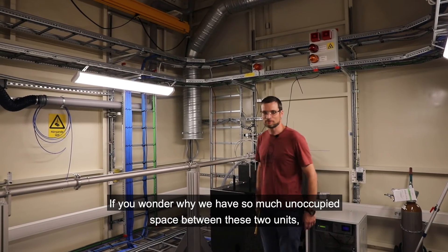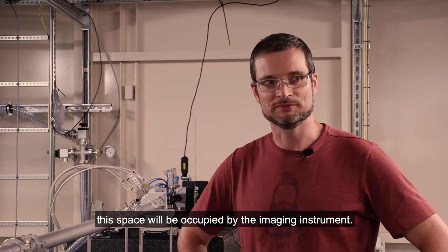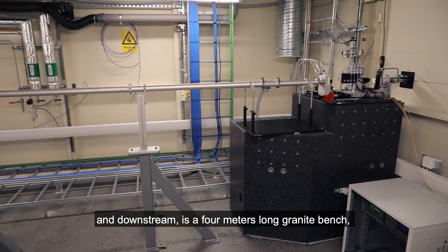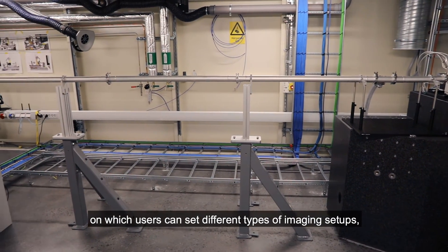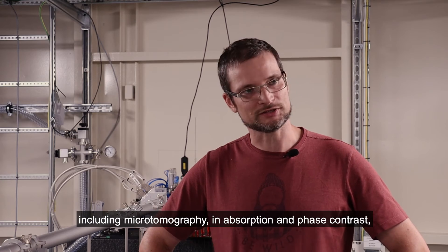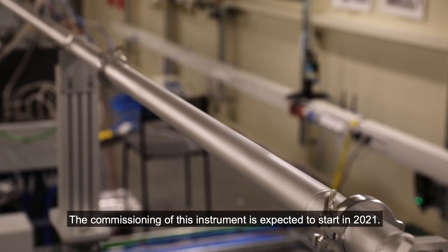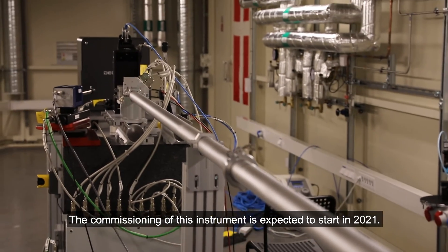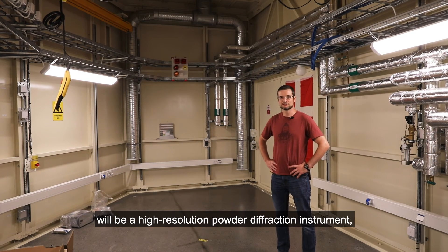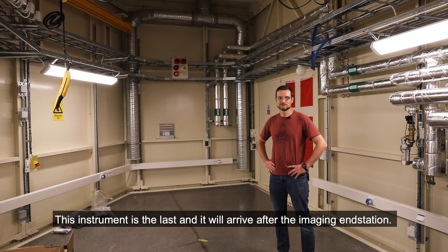The unoccupied space between these two units will be occupied by the imaging instrument, and the imaging sample position is approximately here. Downstream is a 4-meter long granite bench on which users can set different types of imaging setups, including micro-tomography in absorption and phase contrast, dark field microscopy, etc. Commissioning of this instrument is expected to start in 2021. The last instrument to occupy this hutch will be a high-resolution powder diffraction instrument, which will arrive after the imaging end station.